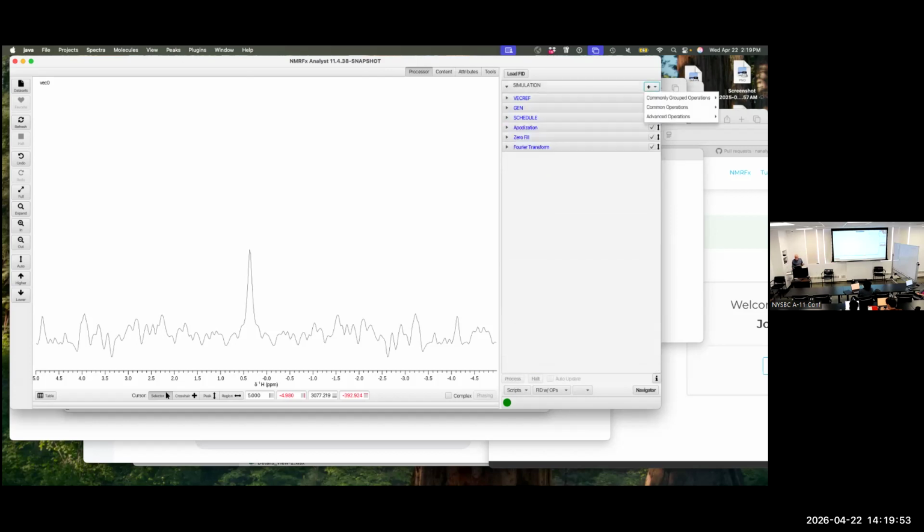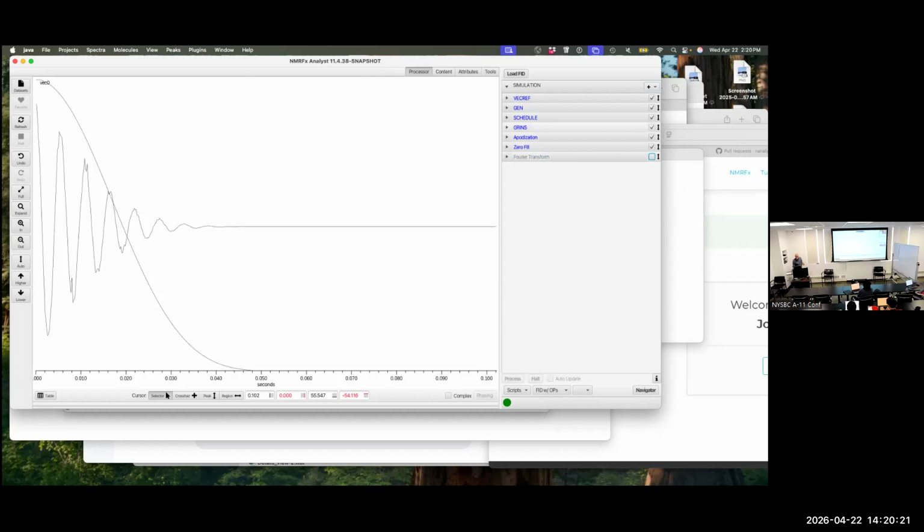We can fix that. And this is lots and lots of people writing lots and lots of publications over the last 10, 15, I don't know how long we've been doing this now, 20 years. We can go to advanced operations, sampling schedule, and there are a whole series of operations. I've got one called GRINS. So if we go back and look, let's turn off the Fourier transform and turn off GRINS, it looks like that.